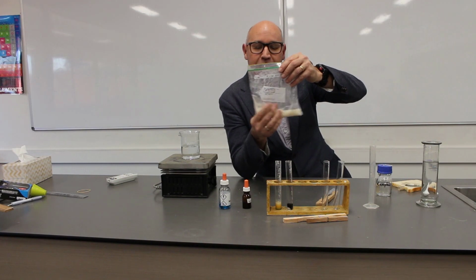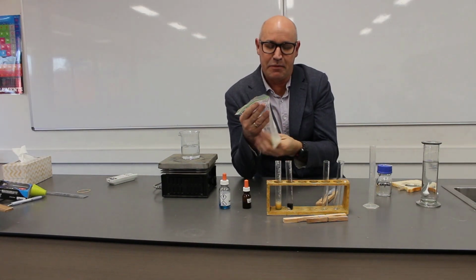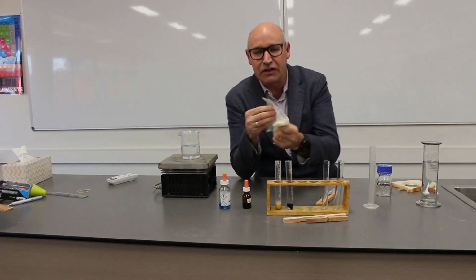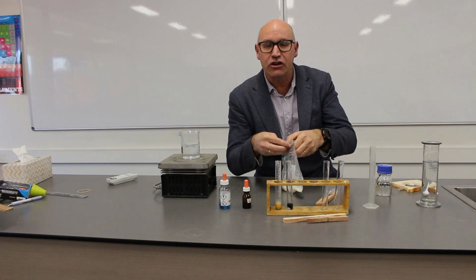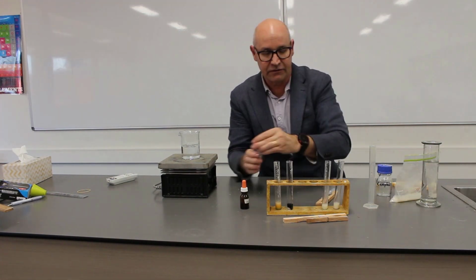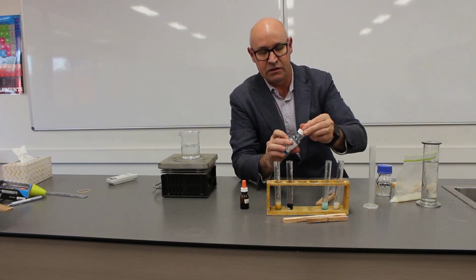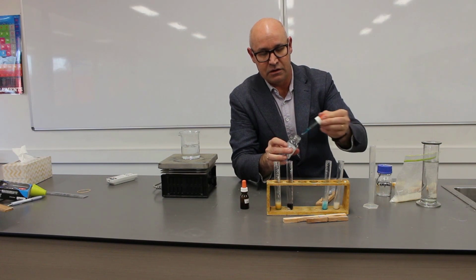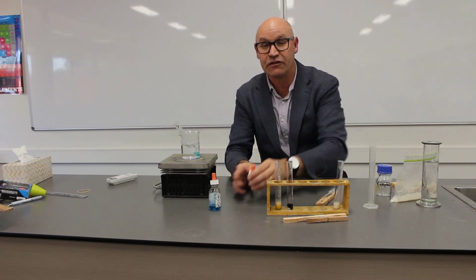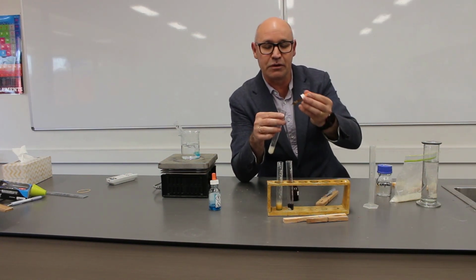So after the amylase has been in our bag for 5 or so minutes, while you've been continually massaging it, we're going to go ahead and test for starch and for glucose again. So we'll put Benedict's test in first. Okay, again that's going to go in the hot water. Now we'll also do the starch test. Now remember, a positive for the starch test is that blue-black colour.